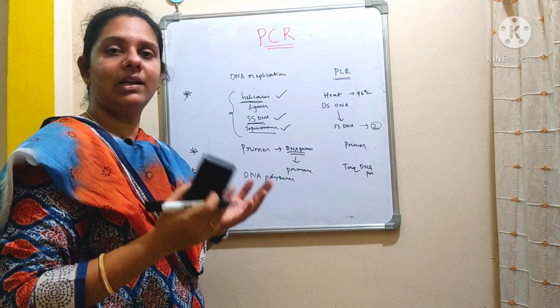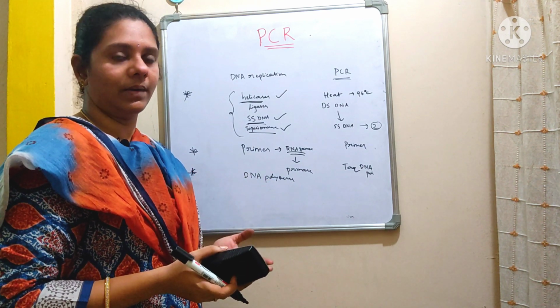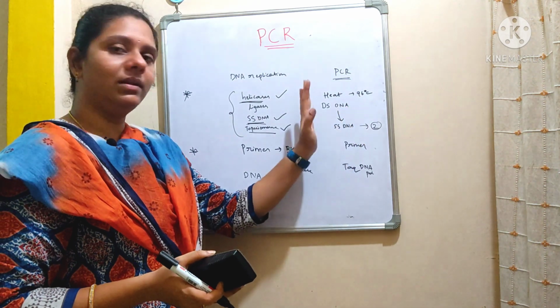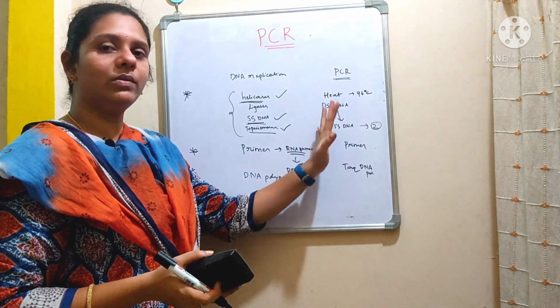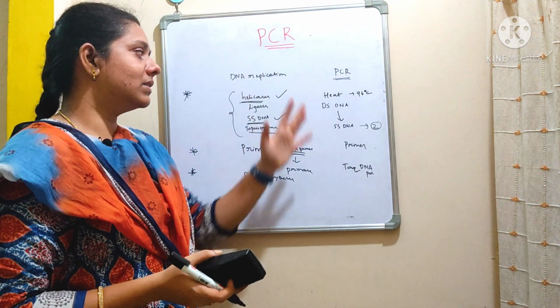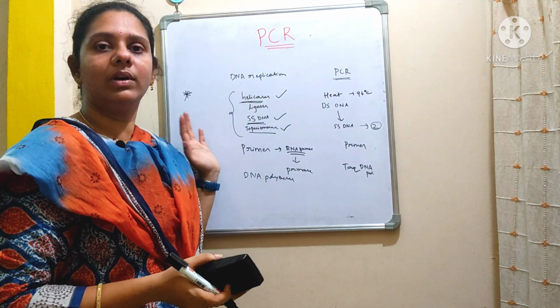In both cases, the ultimate goal is the synthesis of DNA. But here, with minimum requirements and in in vitro conditions, we are going to synthesize the DNA with the help of an instrument called PCR. And this is carried out in vivo conditions.